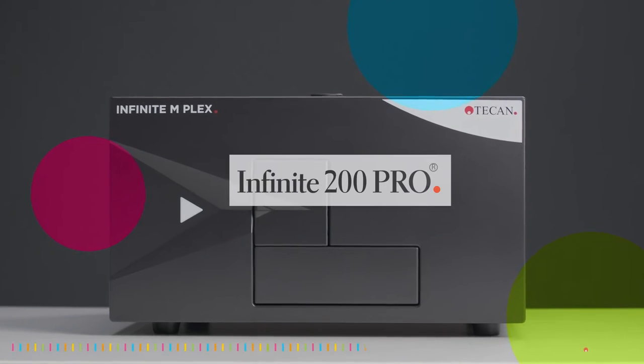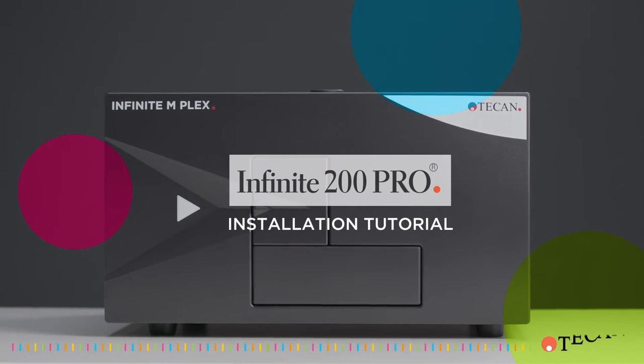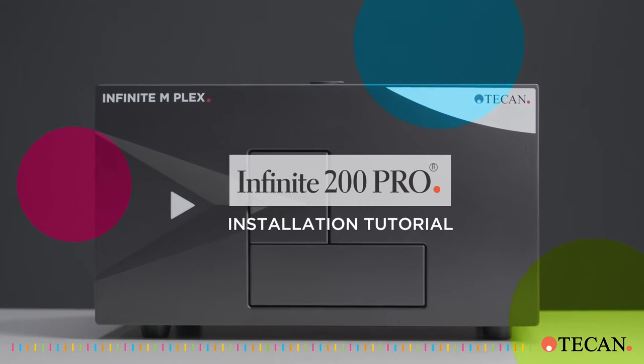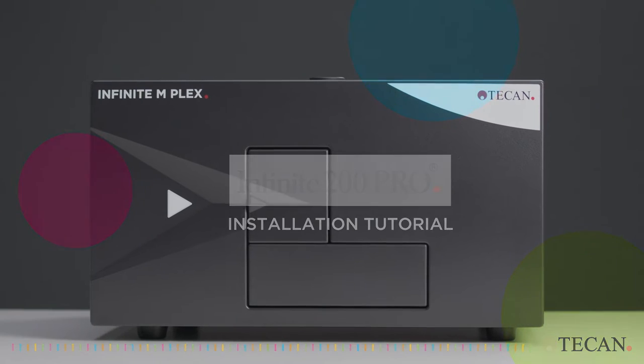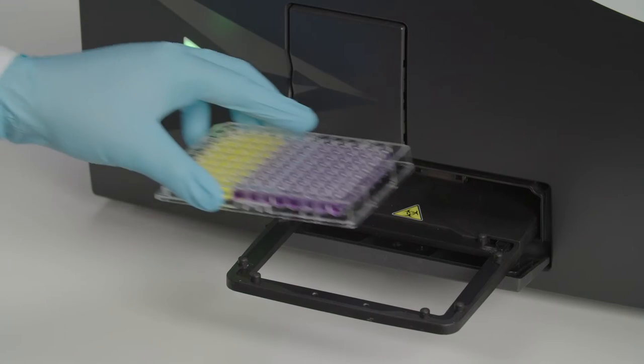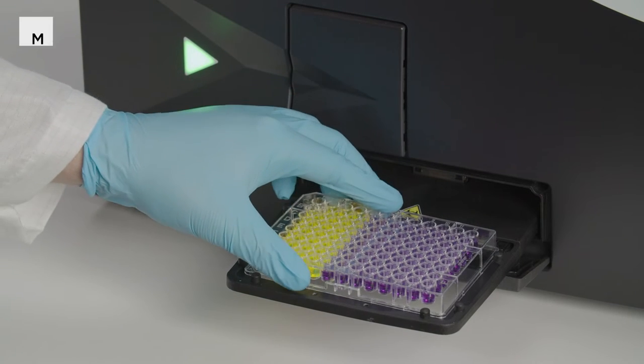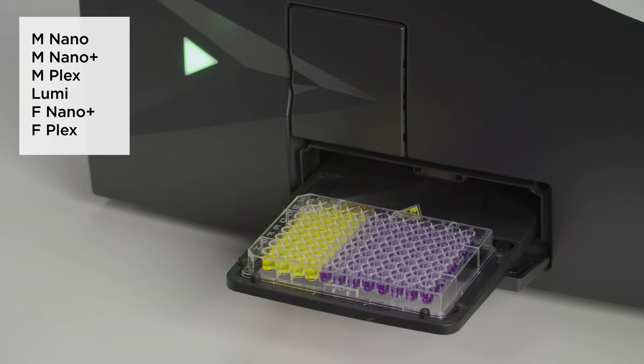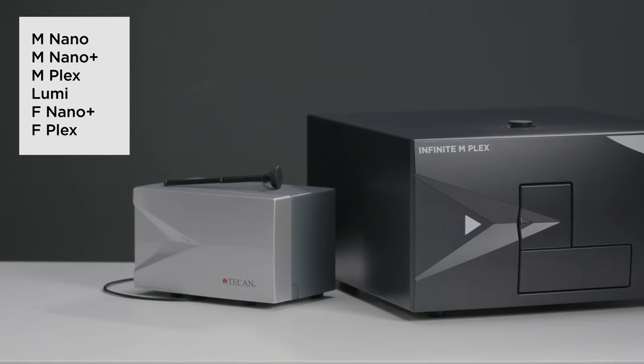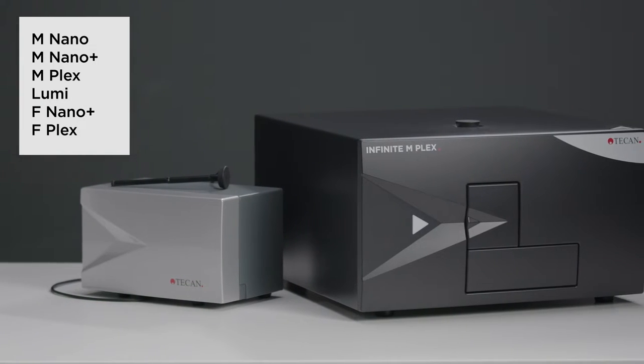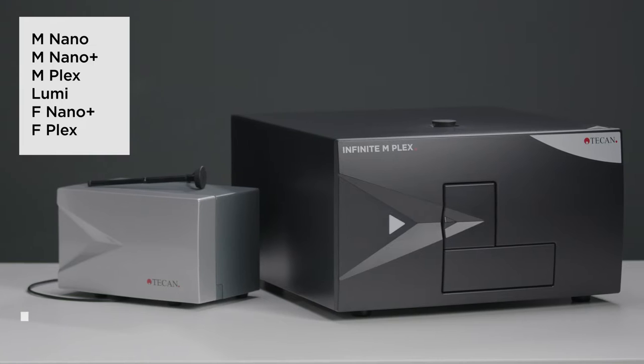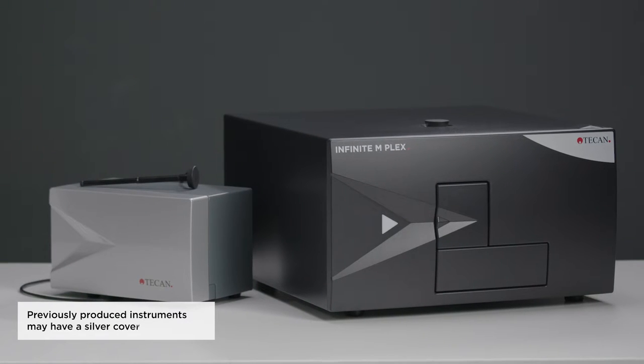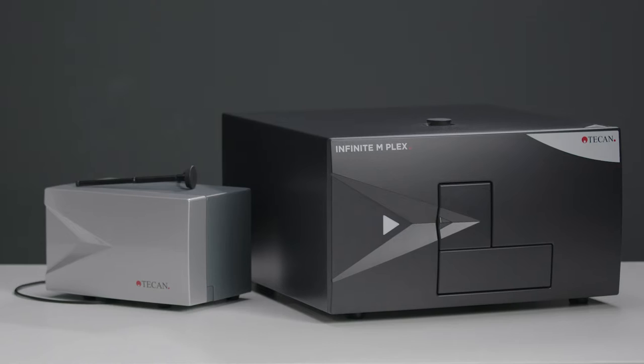Hi and welcome to the installation tutorial of your new Infinity 200 Pro and the iControl software. You will have one of the six application tailored configurations that are available. Four monochromator based and two filter based devices to give you high quality solutions for absorbance, fluorescence and luminescence measurements.